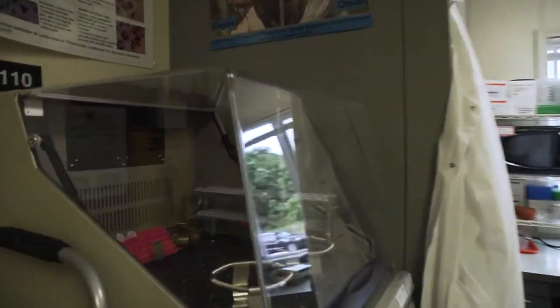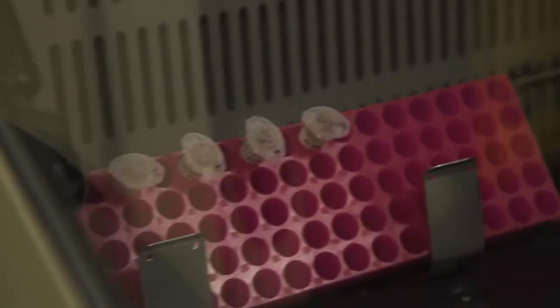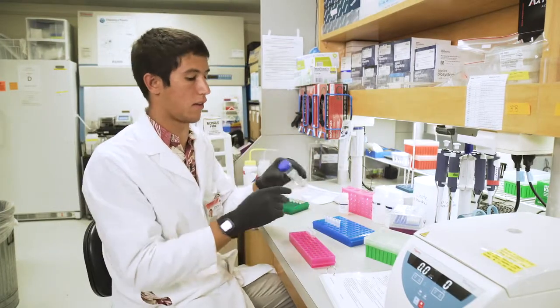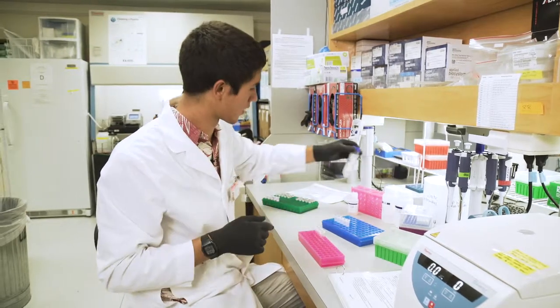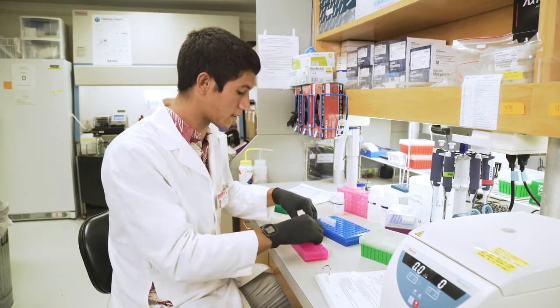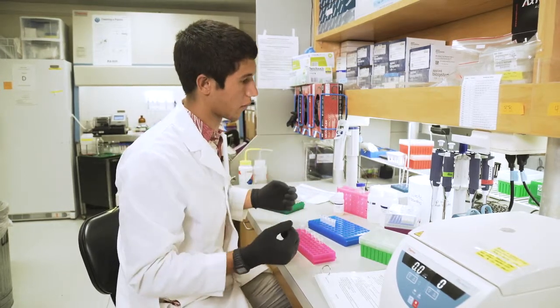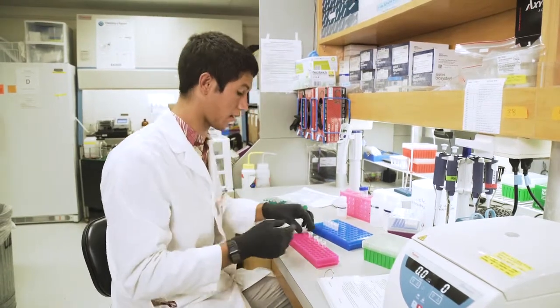Now we wait. Now that they've been inverted, we're going to go ahead and add our next reagent. And here we have our ethanol. This is really high strength, like 100% ethanol. We add a little bit of it to each tube. What that does is what's called precipitating out the DNA. That makes the DNA fall out in a solid form rather than being a liquid.